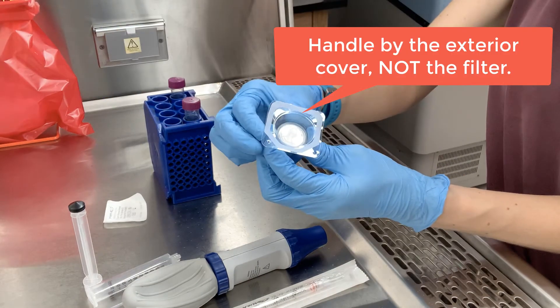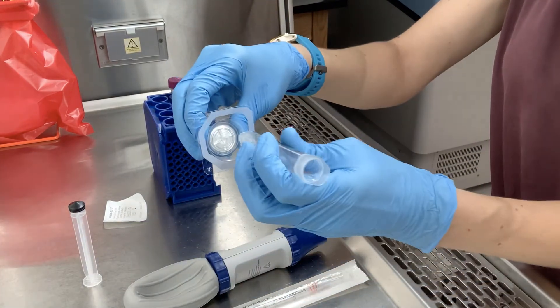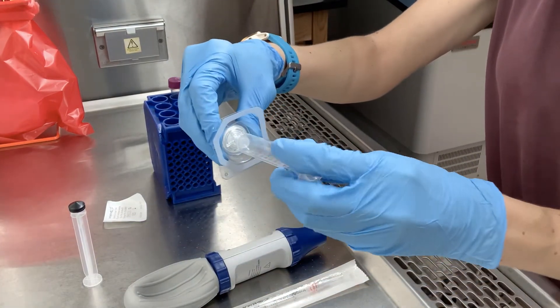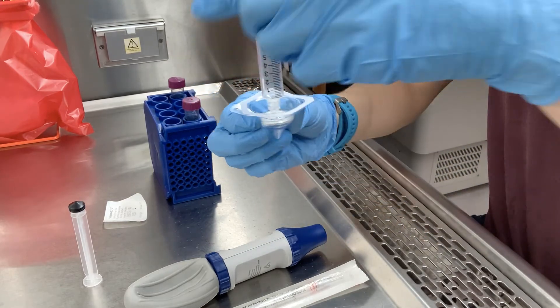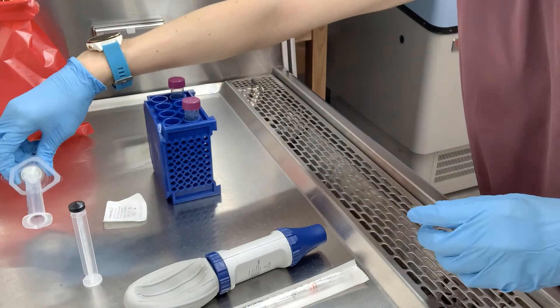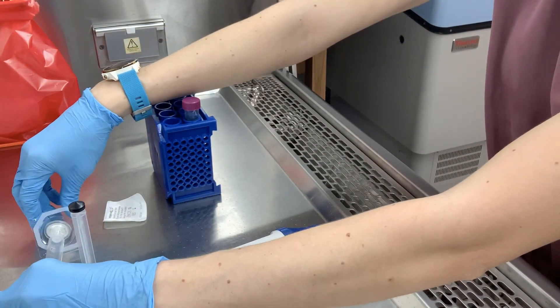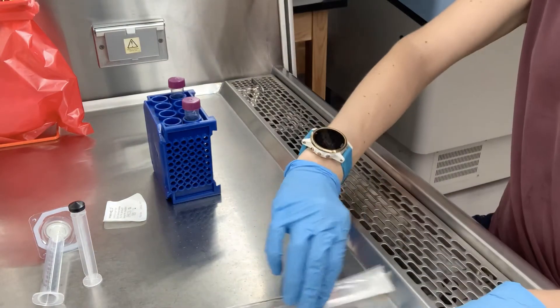Once you have these, open up the sterile filter. Be sure to handle it from the outside, as I'm doing here, not touching the sterile filter itself. Attach the syringe to it by twisting, and then lay that off to the side, keeping the sterile filter inside that plastic sheath to protect it from contaminants.